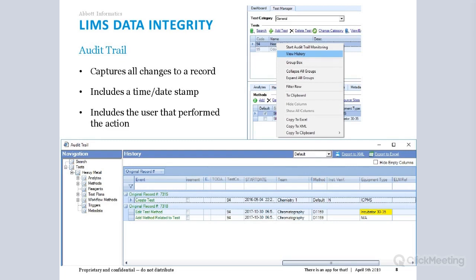It is also important to have a LIMS that is compliant with even the most stringent 21 CFR Part 11 FDA requirements set out for pharmaceutical products, as these provide you with controls on the data such as electronic signatures. It's also critical that you can show your sample genealogy right from receival of the sample through to final results displayed on the certificate of analysis.